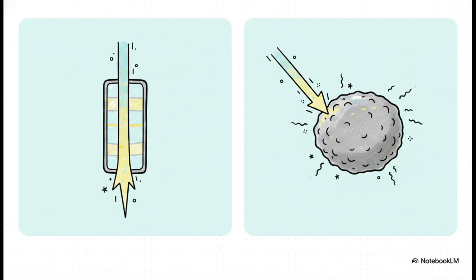The scanning electron microscope, or SEM, takes a very different approach. Instead of slicing, the beam systematically scans back and forth across the intact surface of a whole specimen that has been totally coated in a thin layer of protective metal. The primary electrons bounce off, knocking secondary electrons loose, which are then captured by a detector.